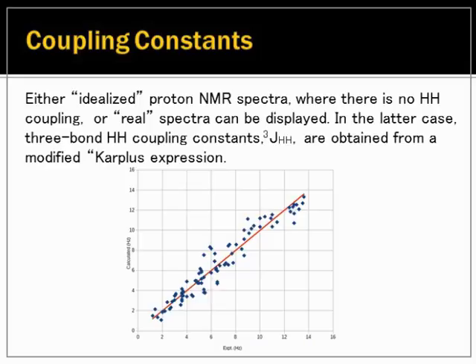Consider that the experimental importance of coupling constants is not to distinguish things that are 1 hertz apart, but things at the 3 or 4 hertz level, arrangements that way versus that way. This is actually quite satisfactory.